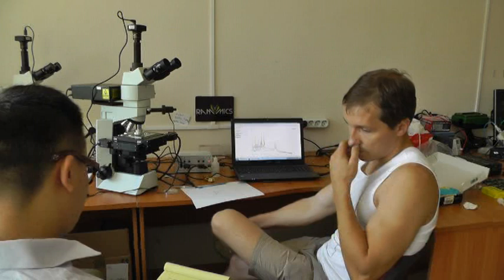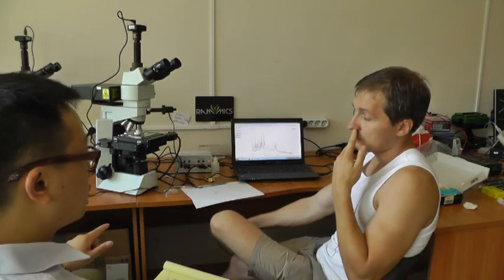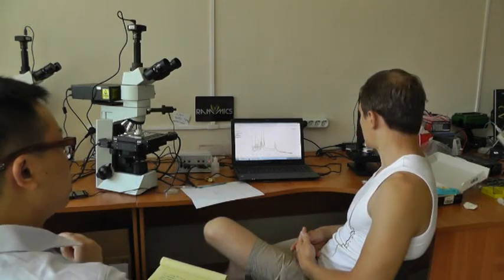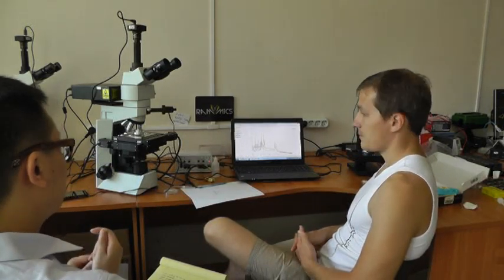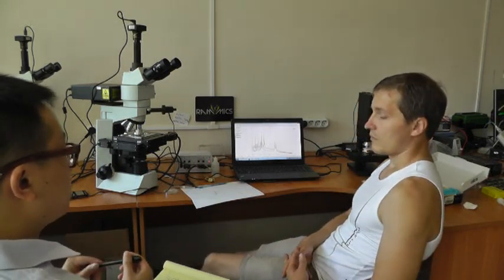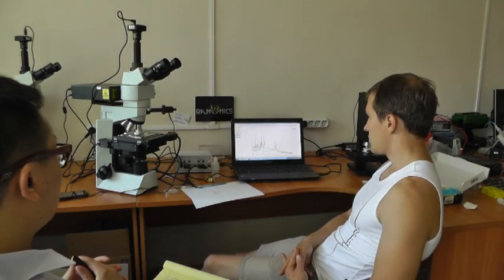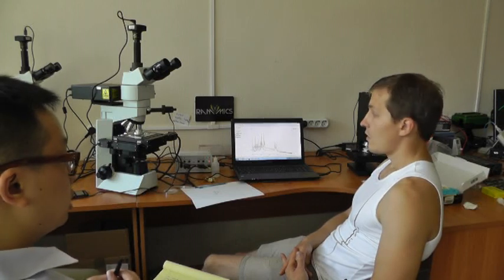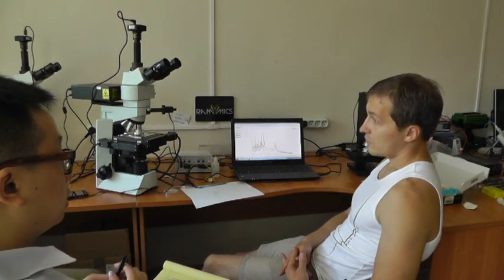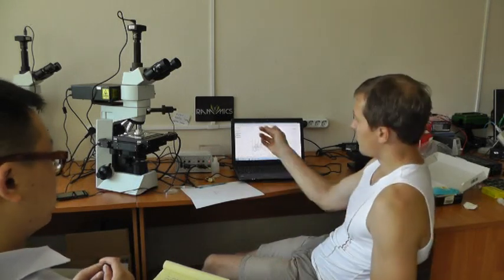Yes. And another question is about the steps, the scanning settings. I think this software is for this device and for that device too, right? So when you set the parameters, there's only how many steps. But step size can also be set by the user.